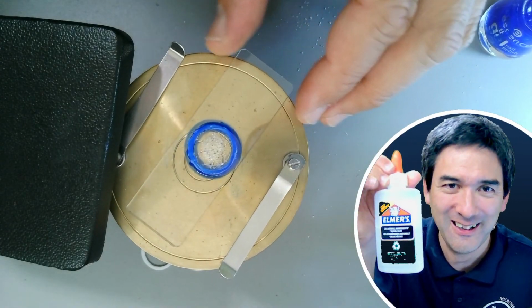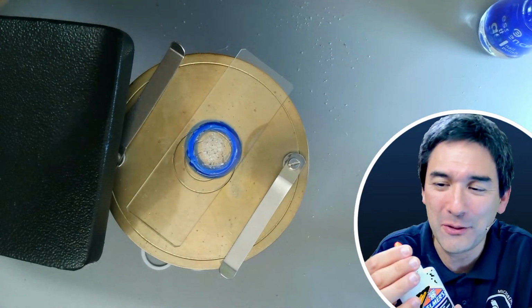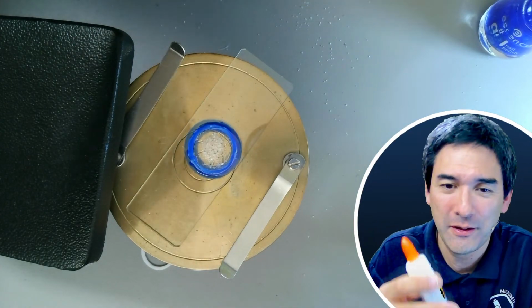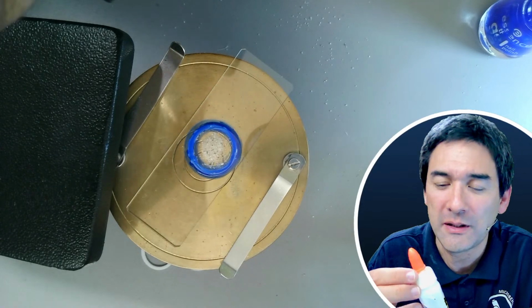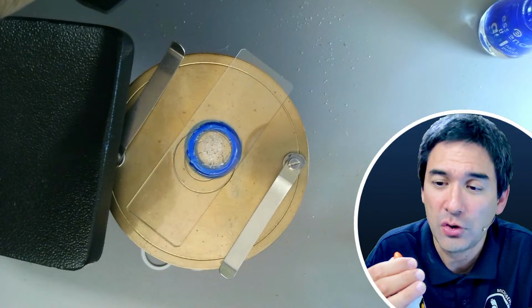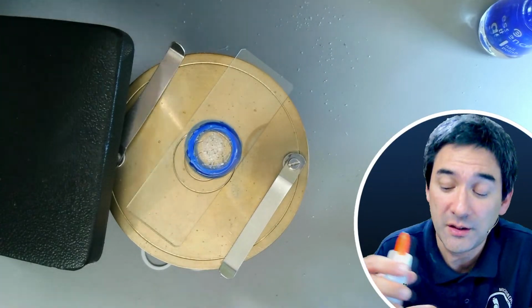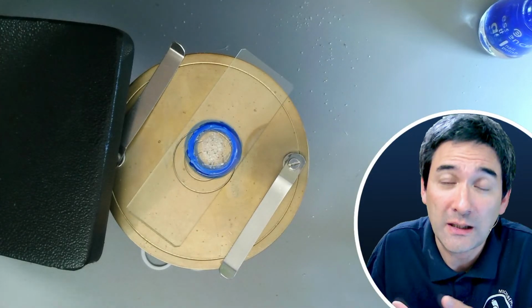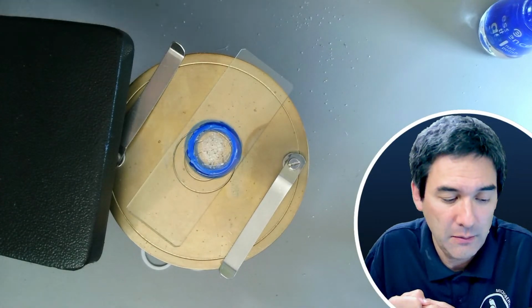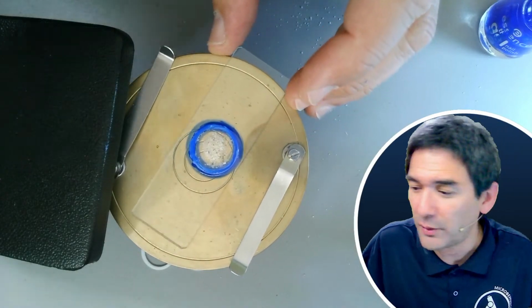That's the Elmer's clear glue, which I'm also using as a mounting medium. However, I think it's very thick, so it should be diluted down. I'm using just nail polish because it dries very quickly. That's pretty much the only reason, and because it sticks quite well to the glass, in my view. But this is something that I've simply experimented with.